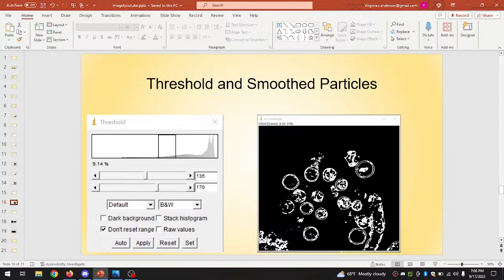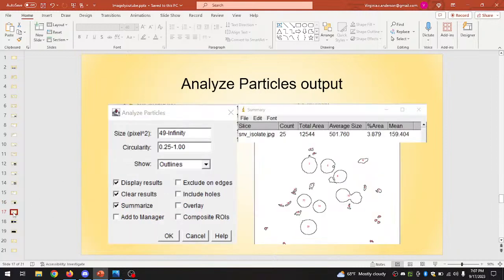So again, I'm just showing a progression through different values, and that there's quite a few things you can do from the very start. And like I said, once you have some knowledge of what ImageJ does, you don't have to do this manually every time. You could set it up for a series of pictures that were very similar and somewhat automated.